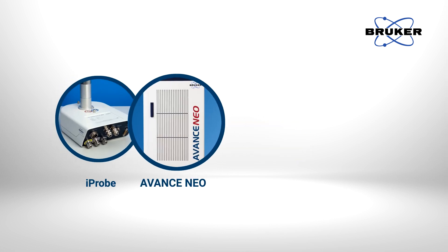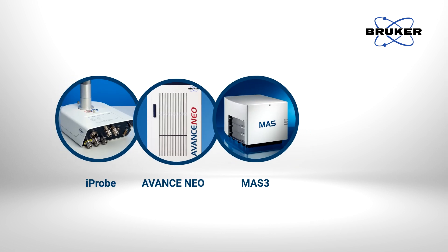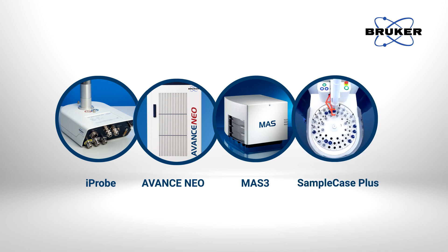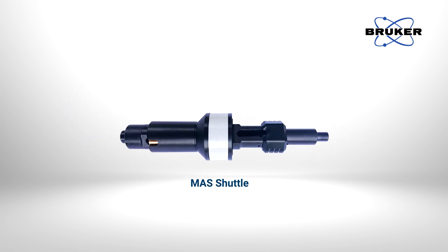All you need is an iProbe with an Avance Neo console, a MAS-3 pneumatic control unit, a sample case automation solution, and a simple consumable, the new MAS Shuttle.